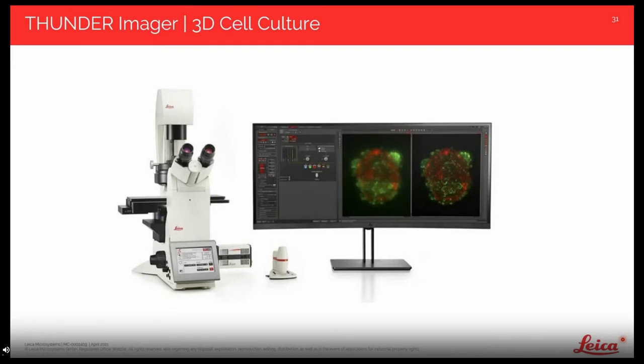So now we've discussed our Thunder technology. Let's see how it's actually applied to our instrumentation. We've given some examples, but we wanted to go through some specific hardware examples that you can use with Thunder. So here we have our 3D cell culture. It's based on our inverted DMI8 platform. We can pair cameras, motorized stages, and other things with it to really give you a high-end microscope.